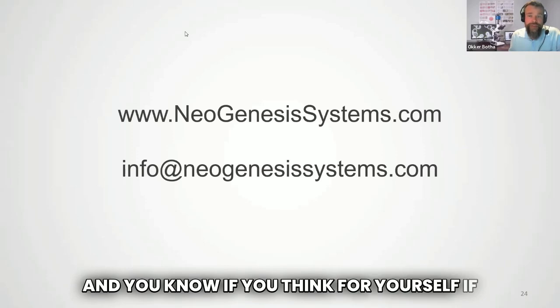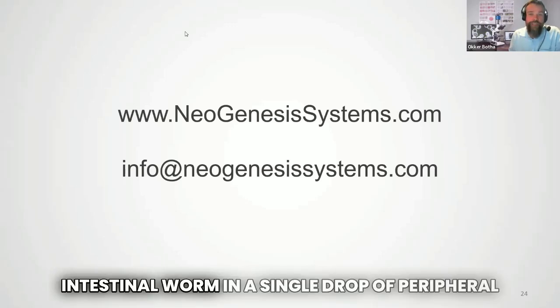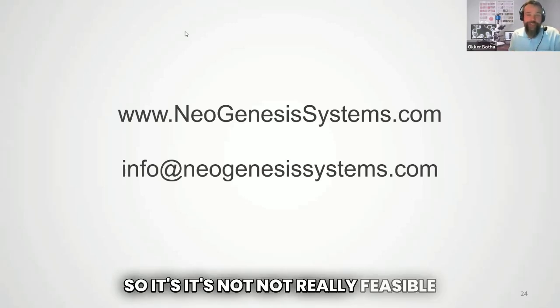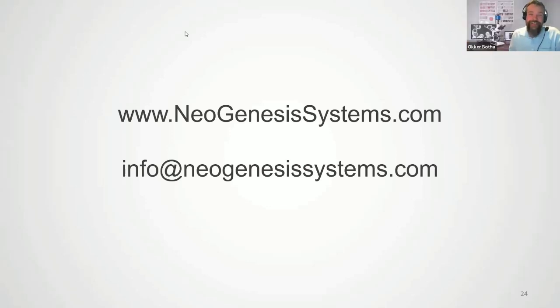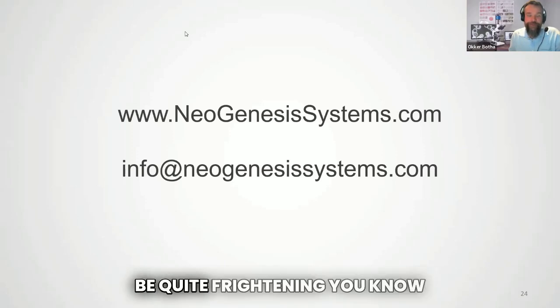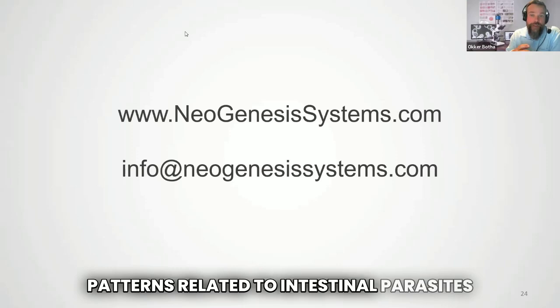And if you think for yourself, if you have an actual parasitic intestinal worm in a single drop of peripheral blood, the client's going to be extremely unwell. So it's not really feasible. We don't really see that. Normal, God forbid. Absolutely. And if you think of how many drops of blood are actually in the human body, it would be quite frightening. So what we see in the dry blood sample are indicators for patterns related to intestinal parasites.